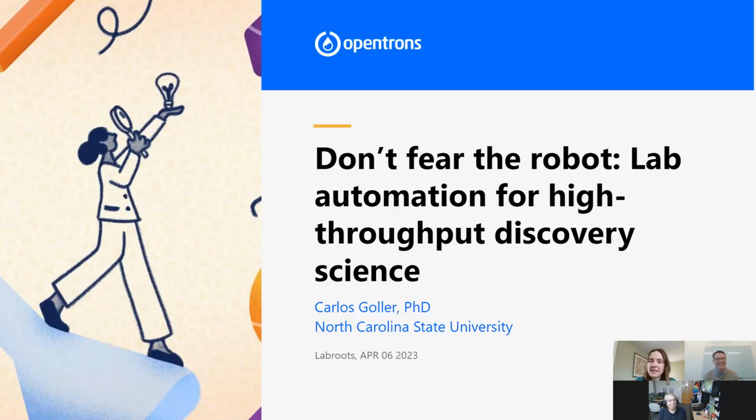I think definitely to analyze those bottlenecks and to start small. Almost all automation is somehow modular, right? So you don't have to go for a 6-figure setup to get started. Wouldn't that be great if everyone had that budget to play with? But you can do it step by step.